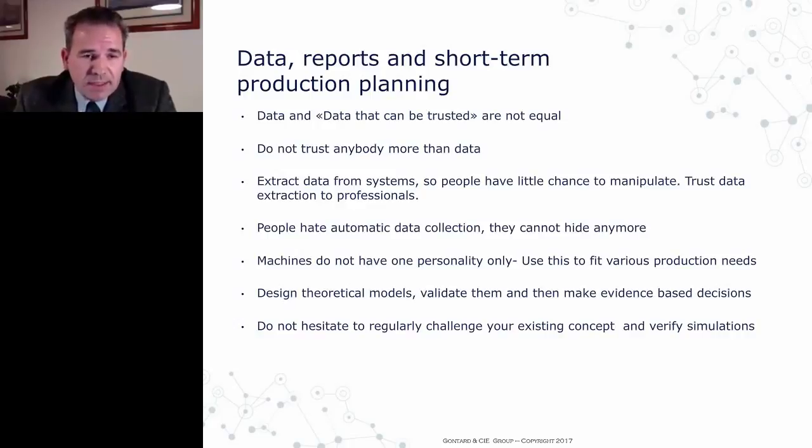Most people look at data. It's like if you were flying an airplane and your altimeter is saying a certain altitude, and in fact you're not at that altitude. It's very dangerous, especially if you work in a difficult environment in terms of payment or in terms of access to technology. In my labs, the first thing we do in the first months is really to test all the data systems and to create an ecosystem of systems that deliver us data that we can trust. And we extract data. We don't like Excel sheets. We don't like people giving us data. We like to extract it, so people cannot hide behind fake data anymore.